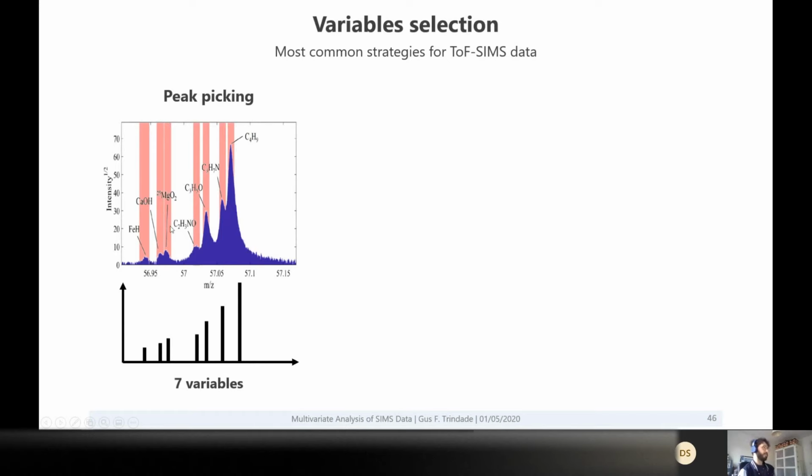So just doing the same for that example I showed with 7 different peaks for the same unit mass. Again, if we pick, we get 7. And this is tough data, right? You're doing Orbi data nowadays, and you know that there'll be many more. Sometimes inside this single one here, you're going to have 3. Sometimes you have isotopes, so there will be many more than 7 if it's Orbi, for sure.